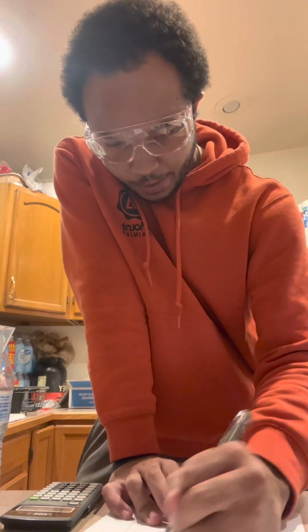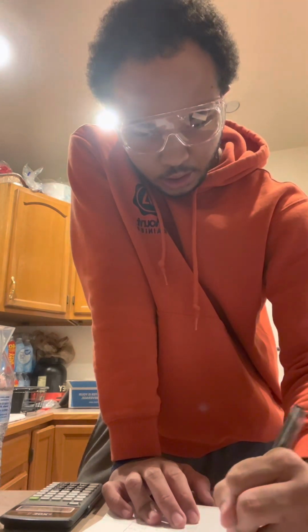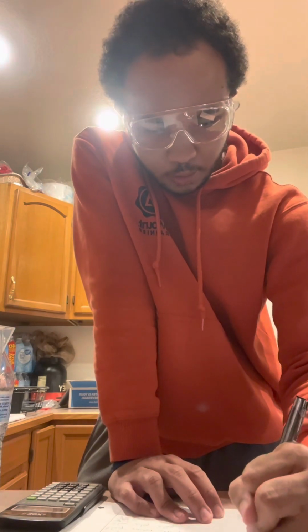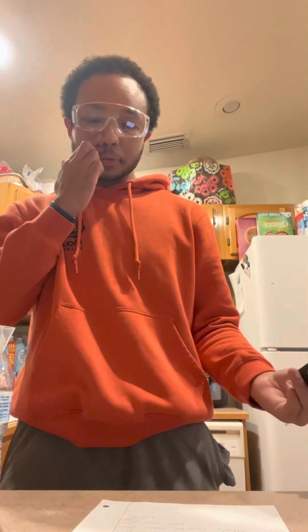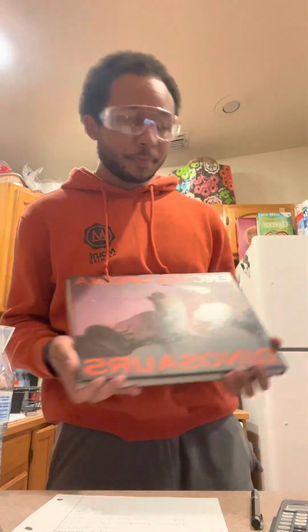Let me write that down. So it'd be 2002.00 centimeters cubed. Remember, this basically means the volume here, because centimeters cubed is like milliliters. So the volume of the block or book is 2002.00 centimeters cubed.